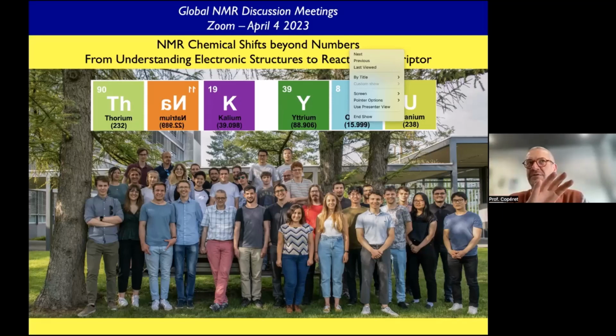For most, I would say, spin half nuclei, you will have to have a ligand that moves, so that's less likely in heterogeneous catalysis unless you look at the ligand. If you look at metal NMR, where you could believe, because it's part of a structure, it's not dynamic, be very careful, because we got surprised by how much this dynamic can affect the quadrupolar coupling constant. Again, nothing surprising when you have seen it, but be aware that dynamic is part of the question. So very good comment, Amit.